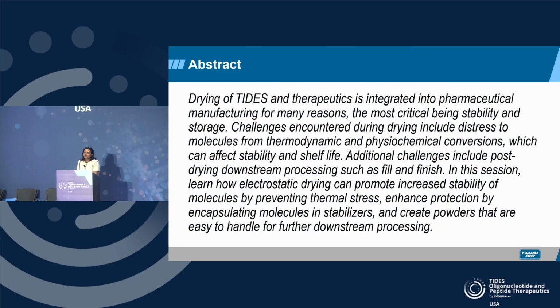So today we'll be discussing how a continuous drying process, electrostatic drying, can help with maintaining stability of thermosensitive molecules and materials during drying, but remove the bottleneck that traditional and conventional drying processes such as lyophilization can create during manufacturing processes.